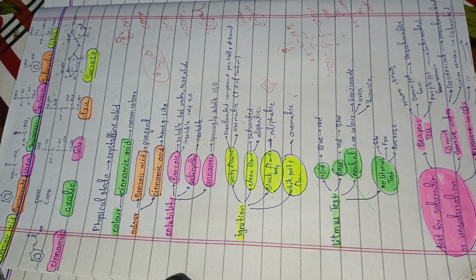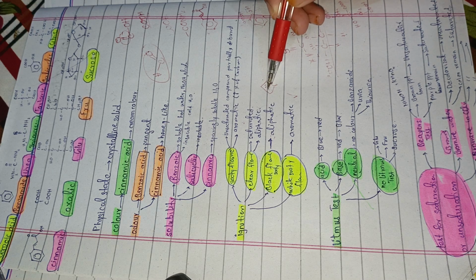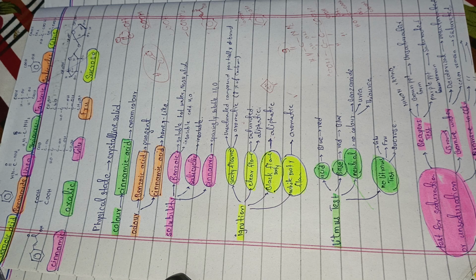Because in the case of glucose, for example, if you burn glucose on another spatula, glucose also gives you a white sooty flame. But what happens is that it leaves a brownish appearance on the spatula. So if a brownish color appears on the spatula, you will notice some kind of carbohydrate is present. And if a black color is present on the spatula, then you will notice that some kind of benzoic acid is present on it. Okay, so now we have discussed how the ignition test works.